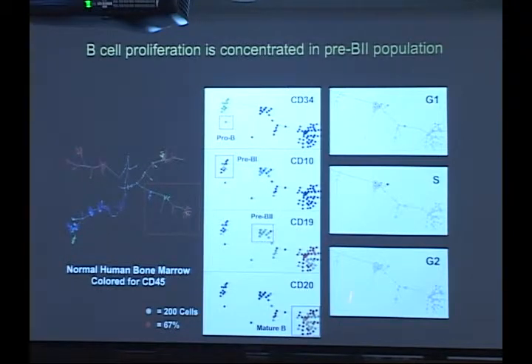This was just a proof of principle experiment, but I've done the same experiment on a set of 5 samples, and we get essentially identical results, and they're really tightly correlated. So this effect appears to be real.